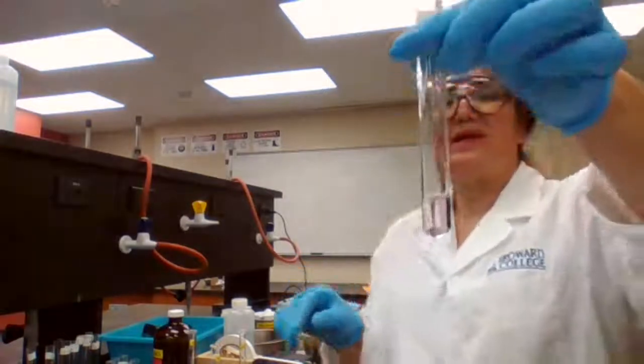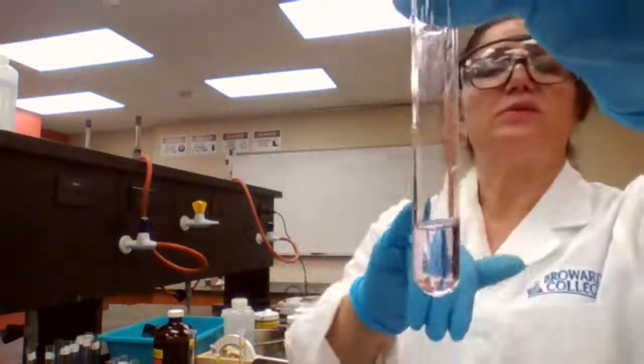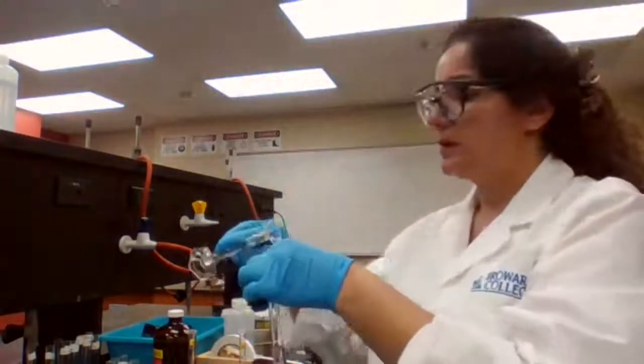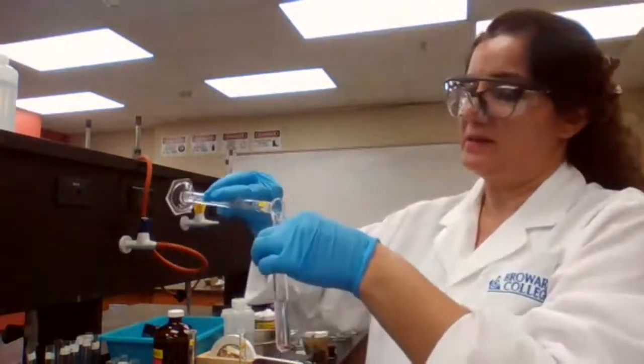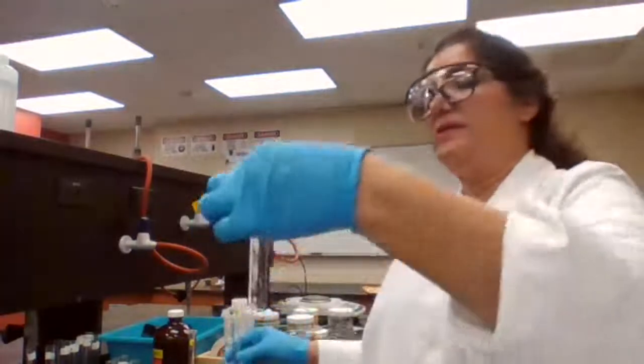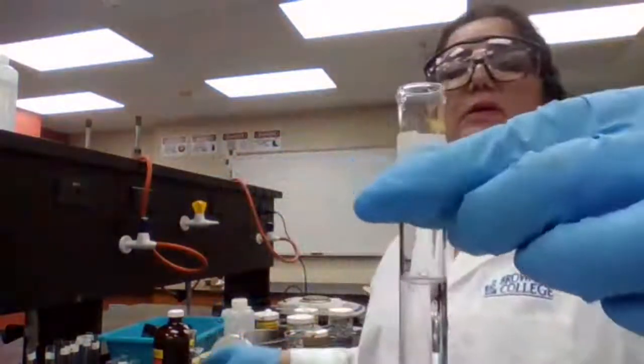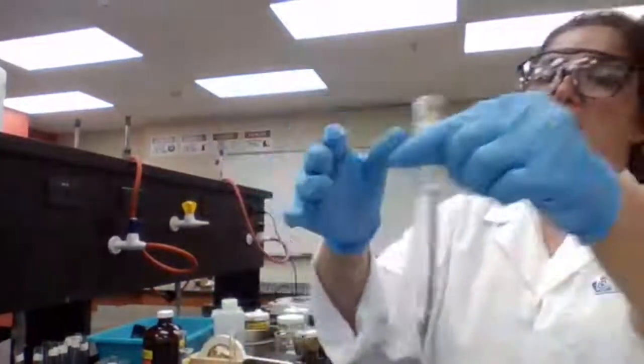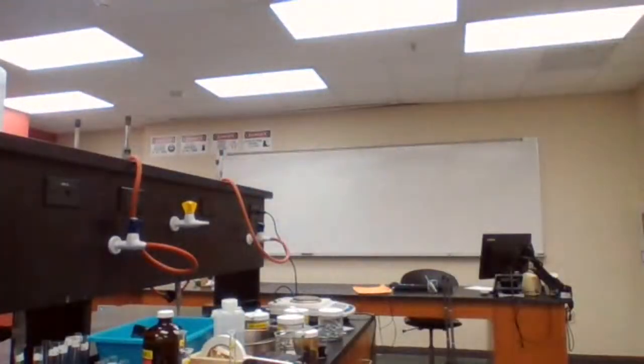Okay, I'm trying to get the solution to this pink color. Then add oxalic acid. Wait for the color change, for the color to disappear. Want to see how long it takes for the color to disappear.